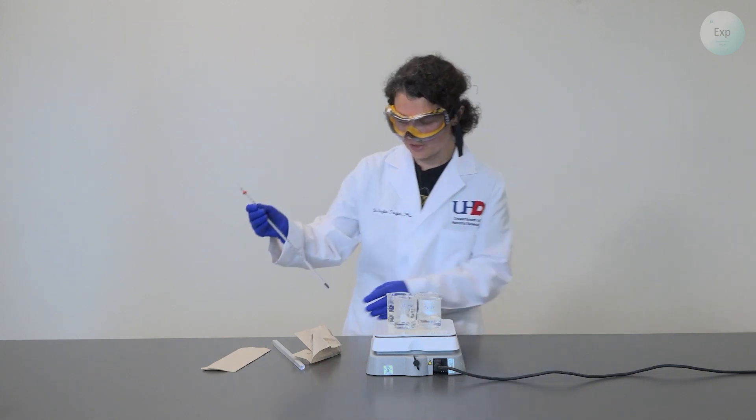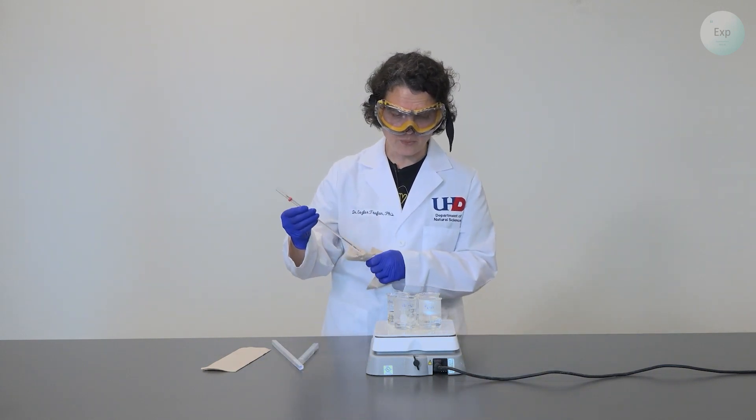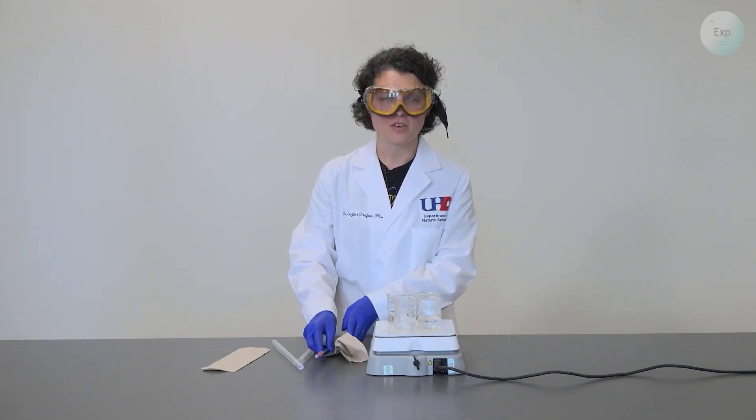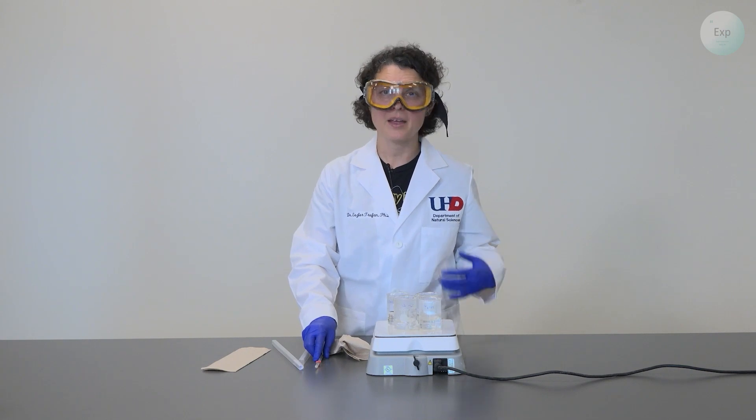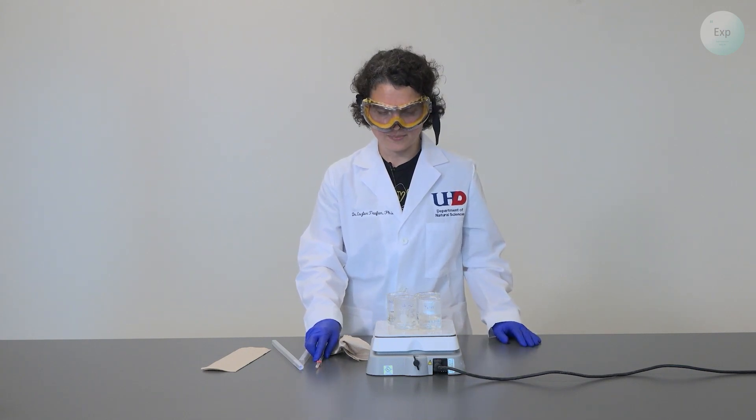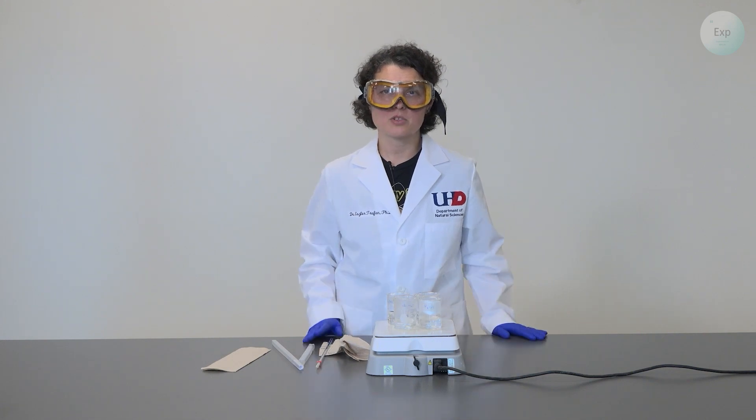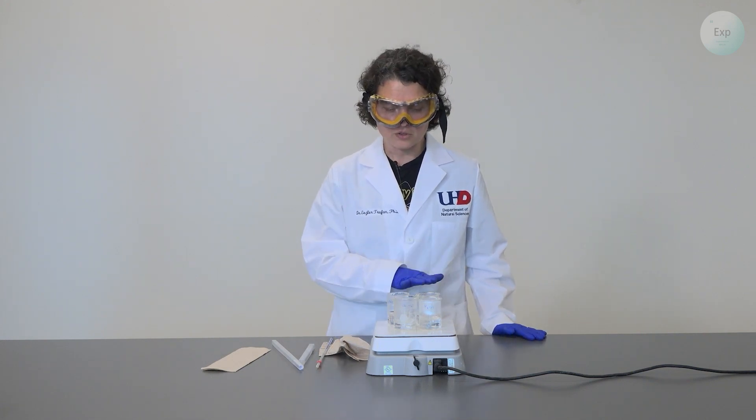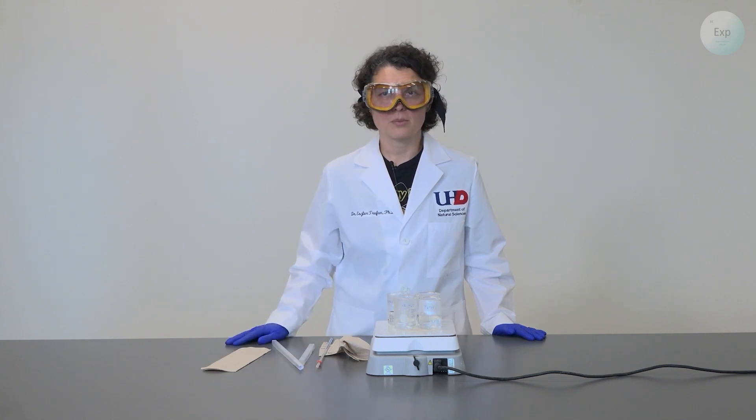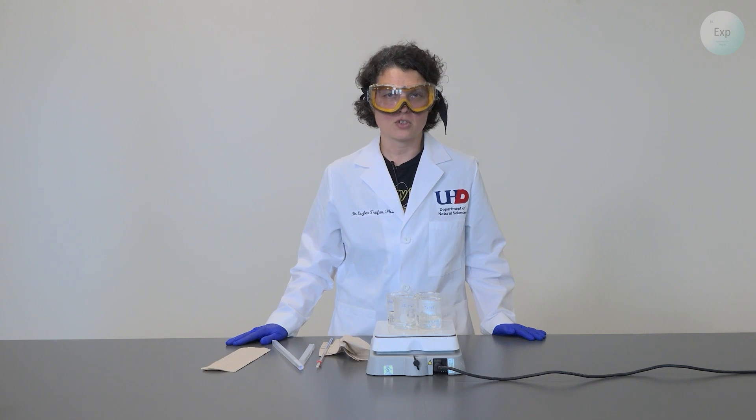We will extract the thermometer because we don't want to wait too long. As more water boils, the more concentrated our solutions become and that may impact the boiling point. We're going to repeat the same temperature collection for the other two solutions with sodium chloride and then determine the boiling point elevation dependence on the concentration of sodium chloride in the solutions.